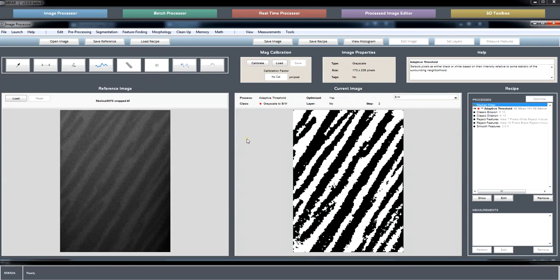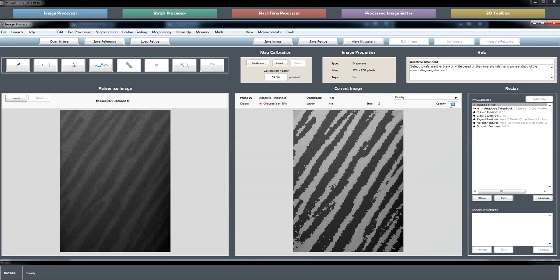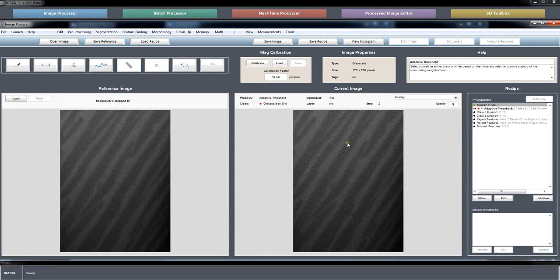In that case, what I think is happening is there are low frequency intensity variations in the image. Basically, you've got varying intensity within each feature from one feature to the next that isn't really helping matters. What you're really after is identifying the boundaries of the features, the edges of the features.